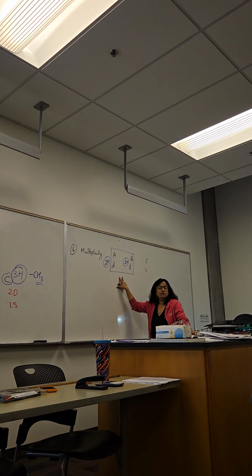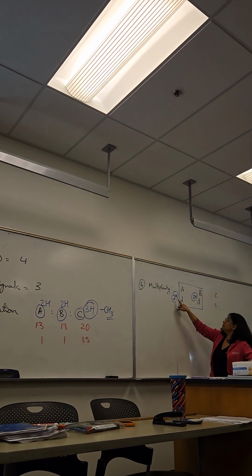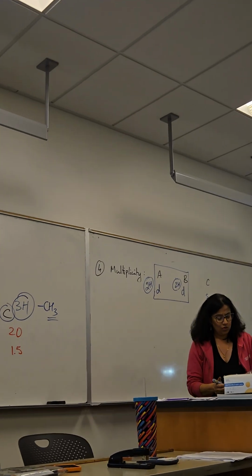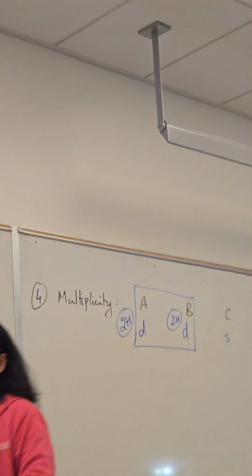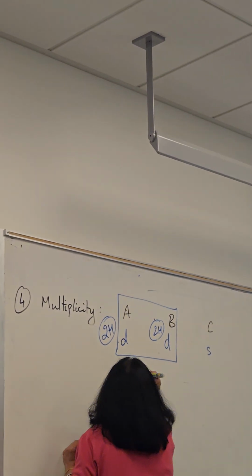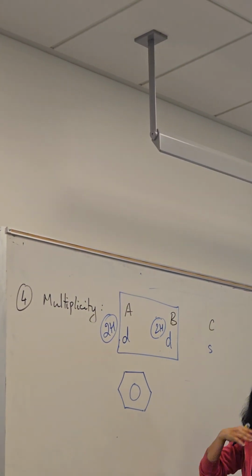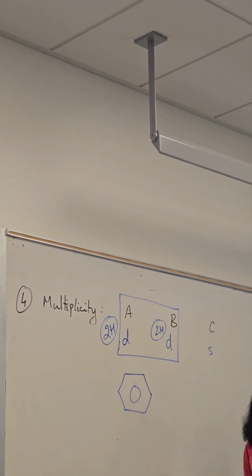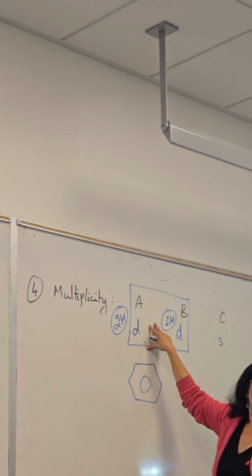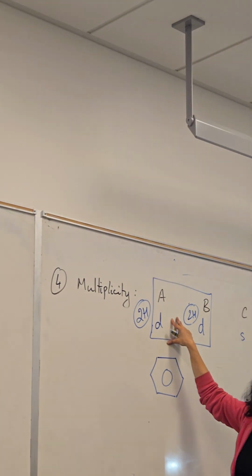These signals are benzene signals, right? What is 2 hydrogens plus 2 hydrogens? 4 hydrogens. So, what substitution pattern does the benzene ring have? If it has 4 hydrogens, how many other things must it also have? 2. So this is a di-substituted benzene. Everybody okay? But here's the trick, the neatest part.